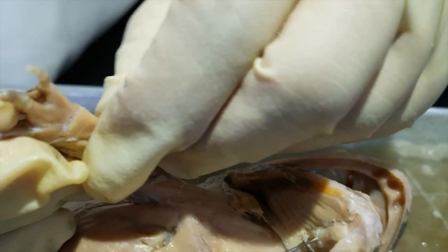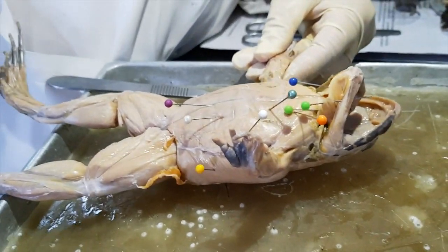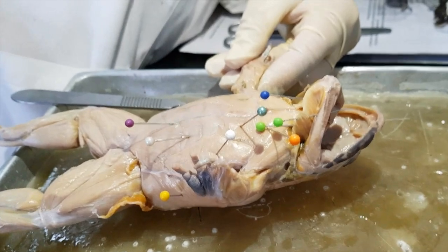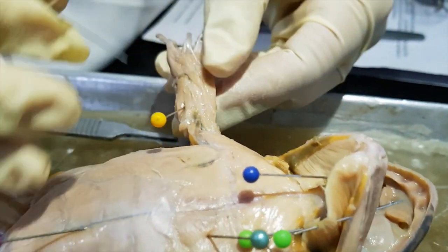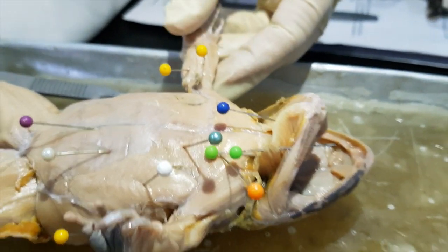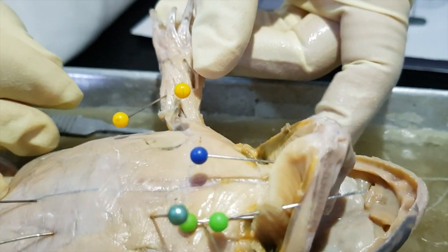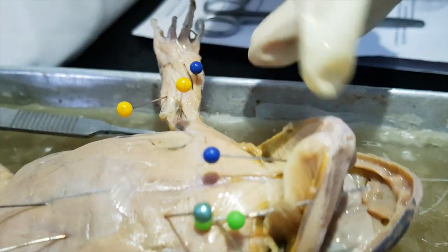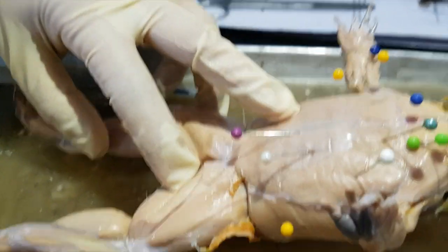Okay, so it could also be seen here. So flexor carpi ulnaris, flexor carpi radialis, and extensor carpi radialis. Okay, so three muscles for the arms.